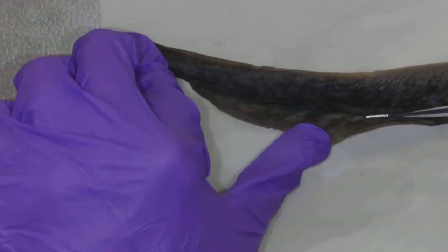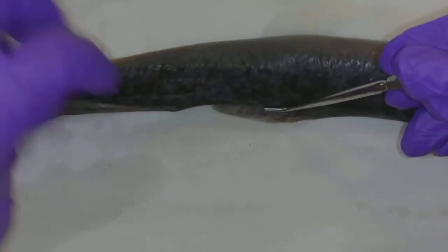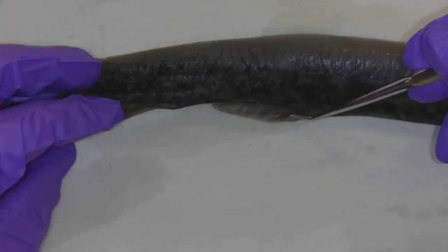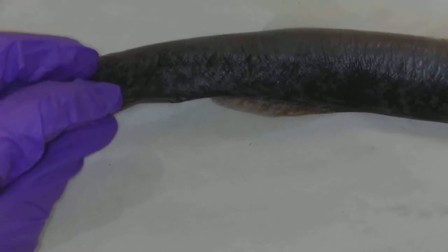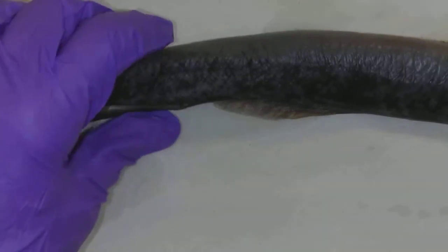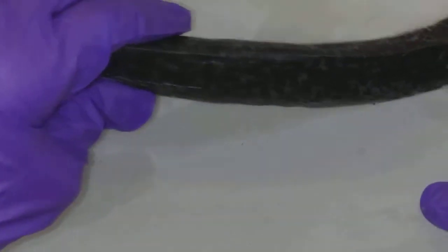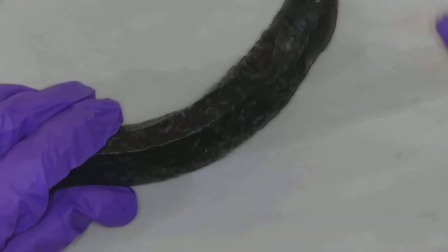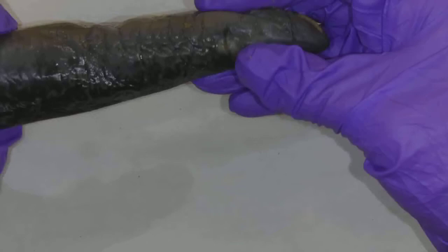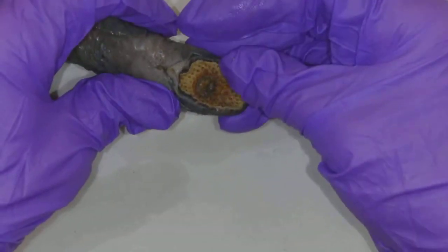Then we have the dorsal fin — that dorsal fin — and here's another little dorsal fin. That helps stabilize this little guy, to keep him from rolling as he's swimming through the water. This particular fish — let's put him dorsal side up — he is a fish, but it is a parasitic fish. This fish spends the majority of his time attached to something else, a shark or other big fish.